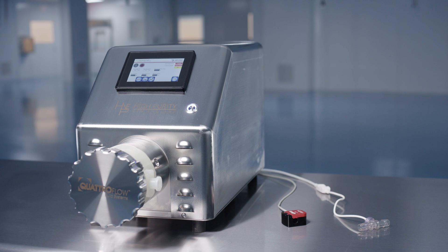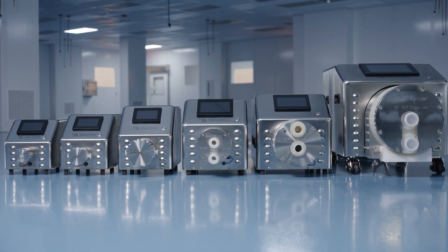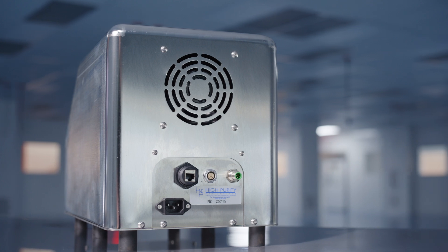Easy to scale up, with flow rates from 1 milliliter to 360 liters per minute in its six-pump range. Easy to maintain, with remote diagnostics when connected via Ethernet.